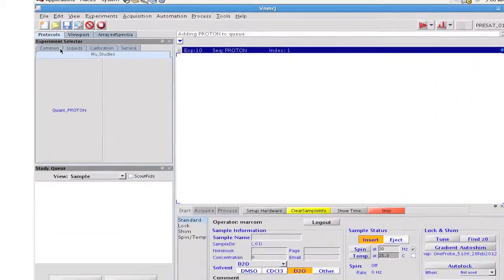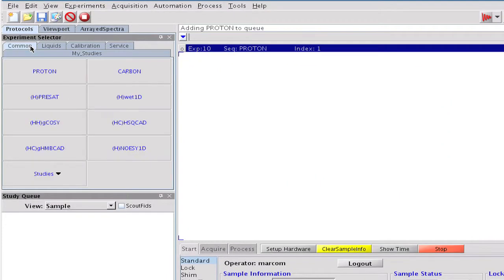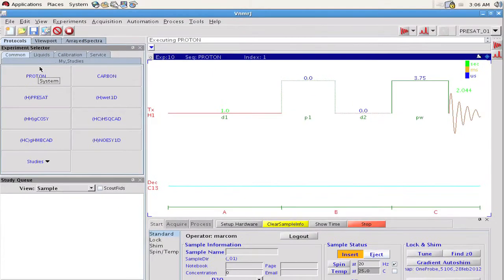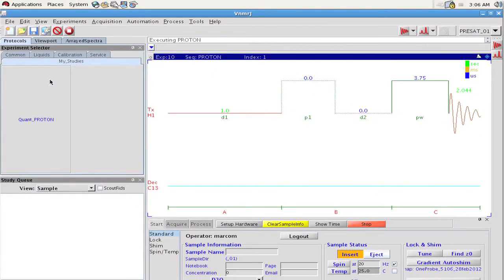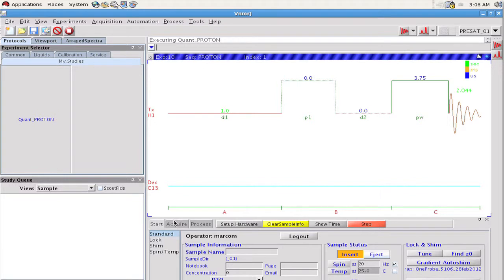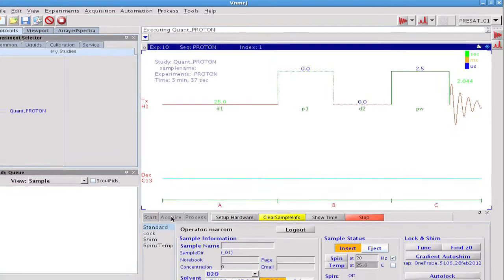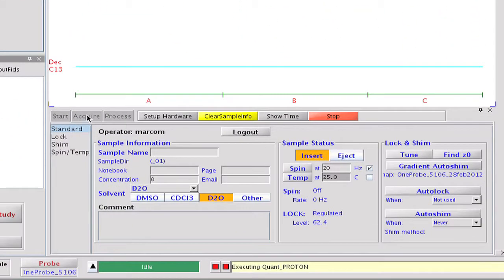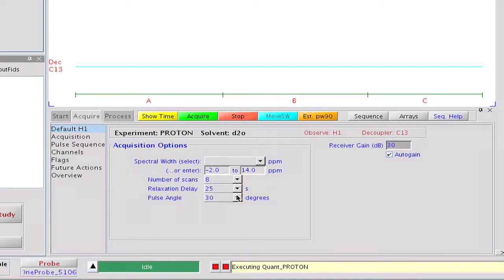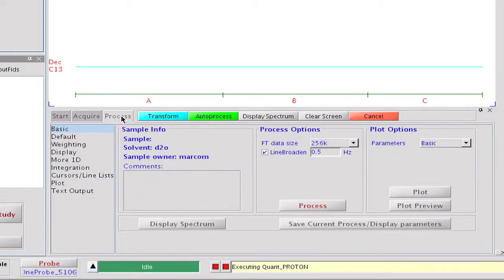We can test our new clone by adding a proton to the current workspace to show the default parameter set, then selecting our new quant proton study clone. Notice that the value for D1 is now 25 seconds as we wanted, and the pulse width is set to a 30 degree tip angle based on our probe file calibration. Our processing changes are also in place, as we can see in the process parameter panel.